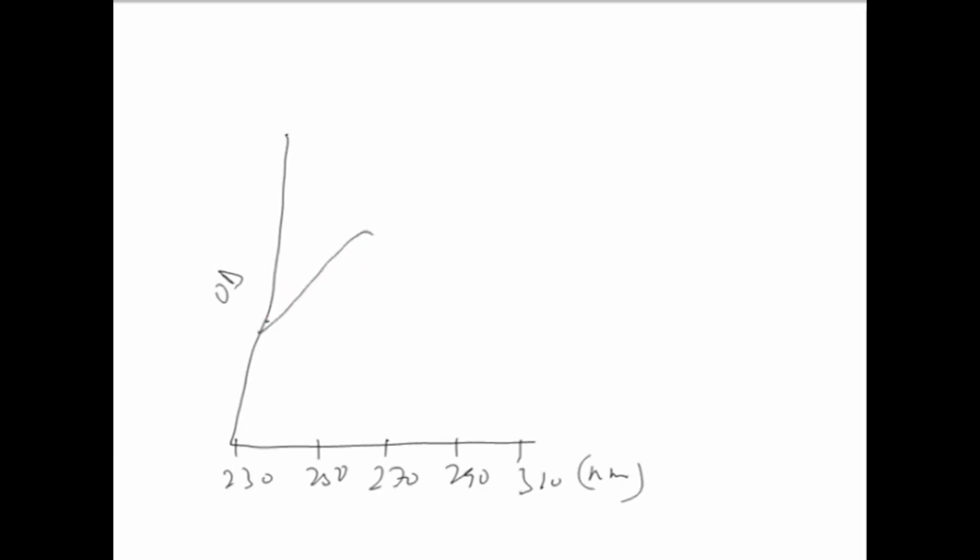And the third part we were talking about is the orientation effects. So, orientation effects, that is, how a molecule is present in a situation. If we take optical density here, and the example we are taking is of DNA, and I think all of you know that DNA is present in different forms.